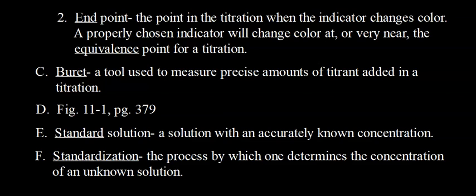And for me, that's a little bit too dark pink. We want the faintest pink possible when we're doing a titration where phenolphthalein is the indicator. So I think they just over-titrated a bit just so you could see. You really just want the lightest pink color possible. I'll show you another video demonstrating titrations later in anticipation for our lab.